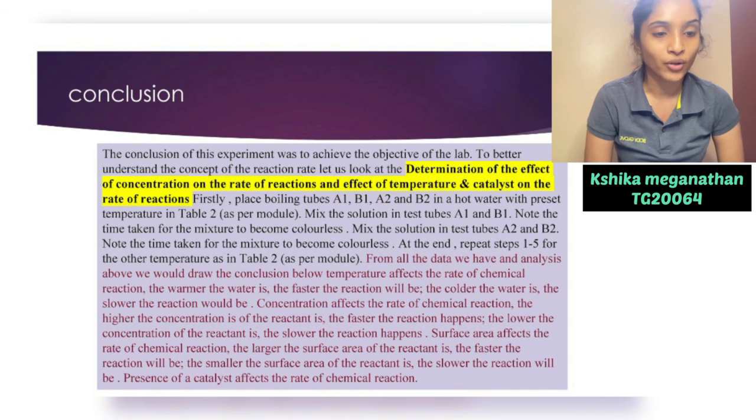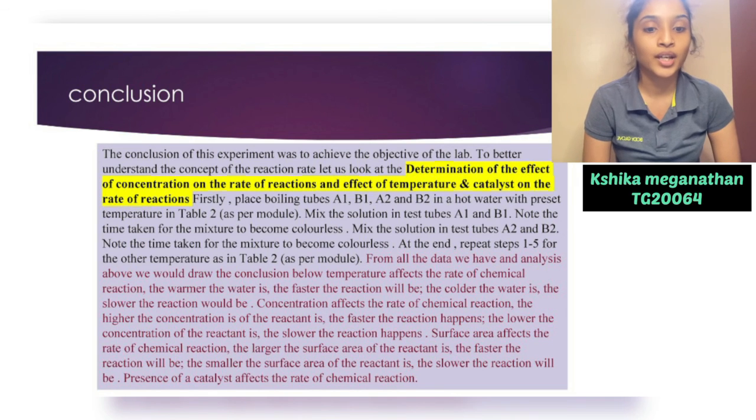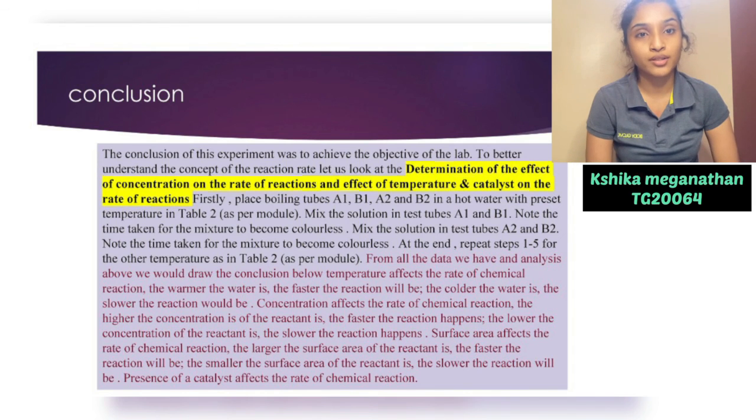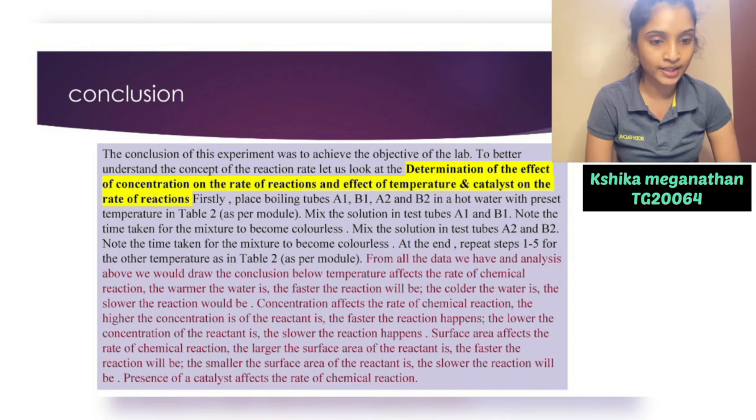From all the data we have analyzed above, we will draw the conclusion below. Temperature affects the rate of chemical reaction. The warmer the water is, the faster the reaction will be. The colder the water is, the slower the reaction will be.